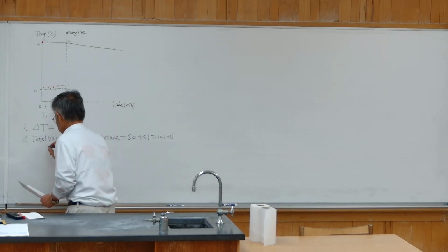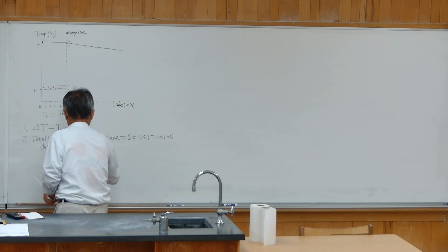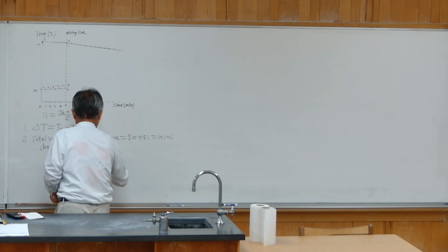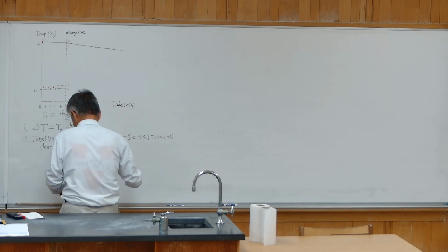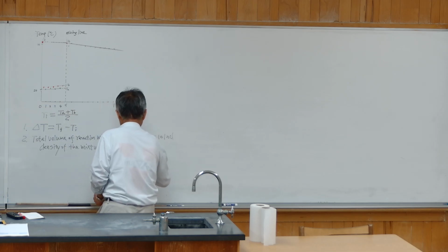And the density of this mixture is 1.04 gram per milliliter.